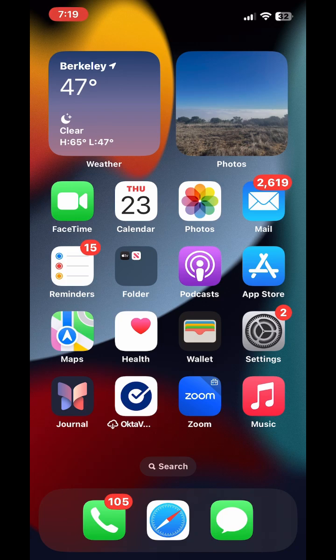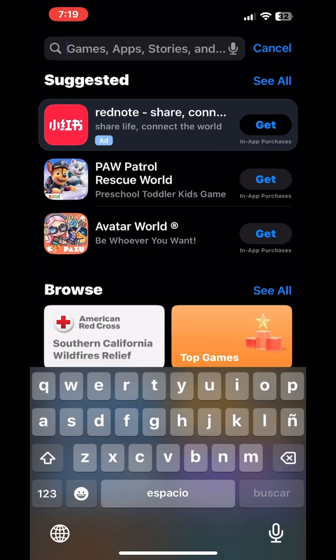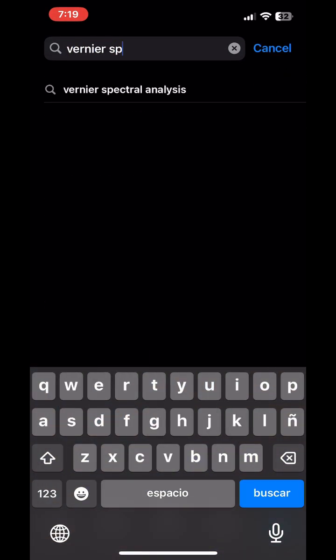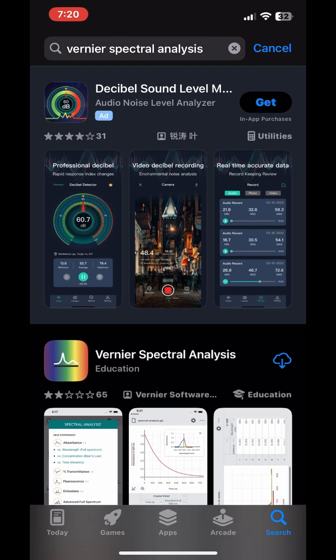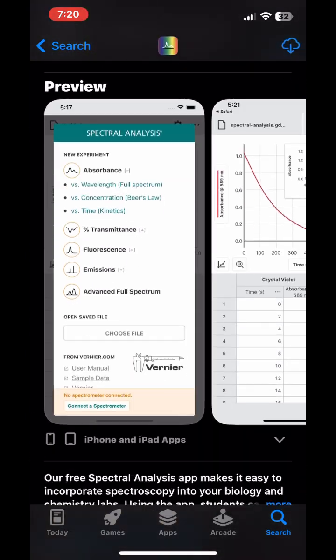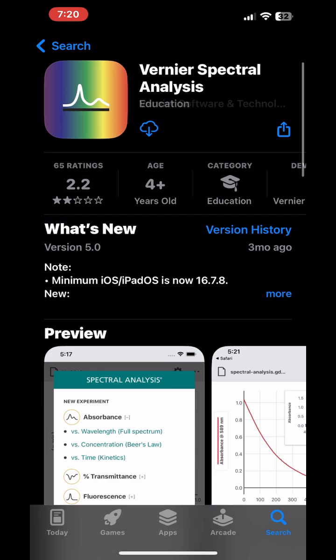This video will be reviewing the Vernier Spectral Analysis app. First, just to show you how to access this app, just enter the App Store and type in Vernier Spectral Analysis. It should come up, and it should be available probably regardless of your device, as it is compatible with Apple, Android, Chrome OS, or even Windows.